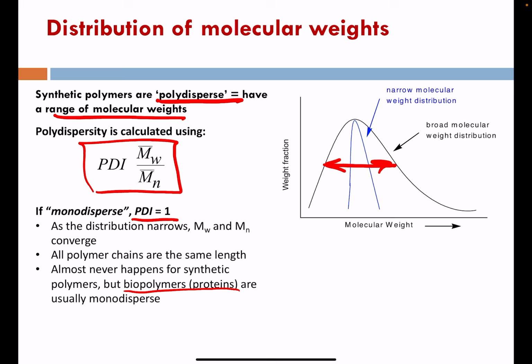So for very low polydispersity samples, like the former example on the previous slide, we can think about all polymer chains being very close in molecular weight to one another, but certainly if it's a synthetic sample, never will all molecules present be exactly the same molecular weight.